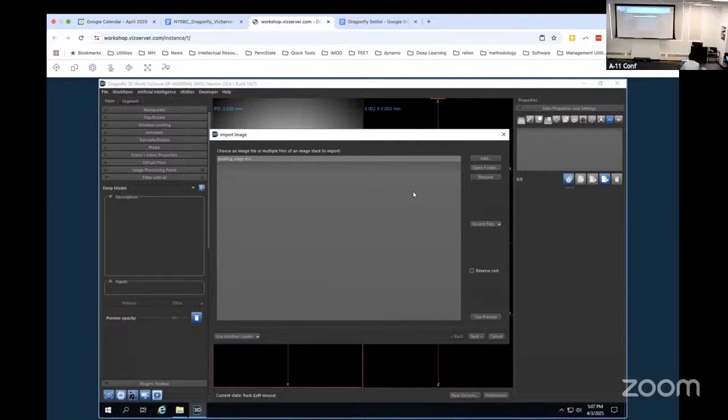Really? Yes. That's what it's doing. Too much time. Yeah, so that, you're not that. Got stuck with my add. On the add. Well, the folder requires. Okay. There's a standard folder. Yes.